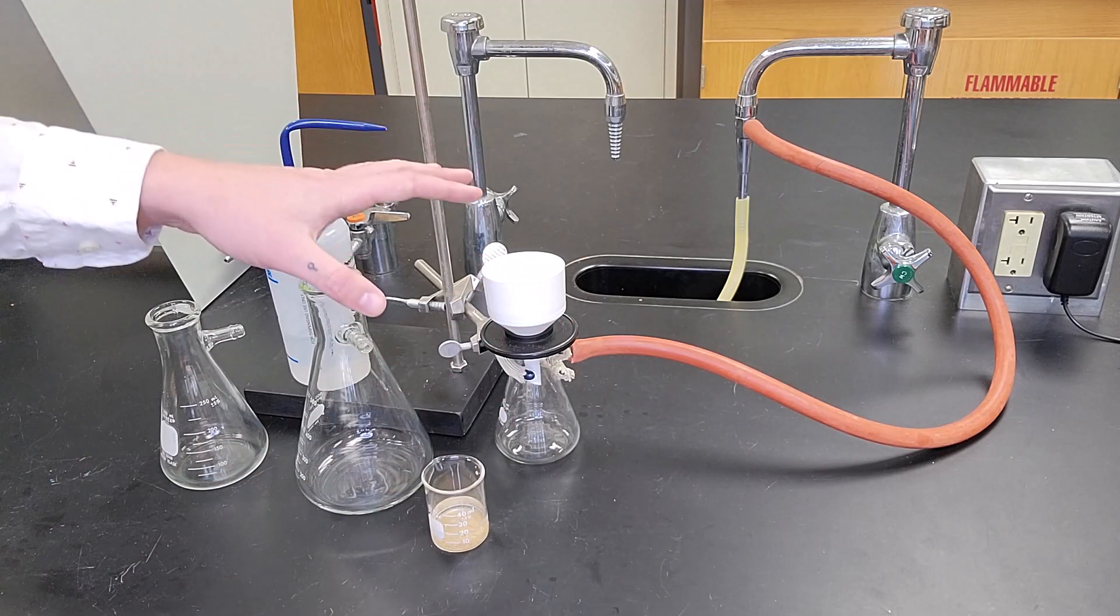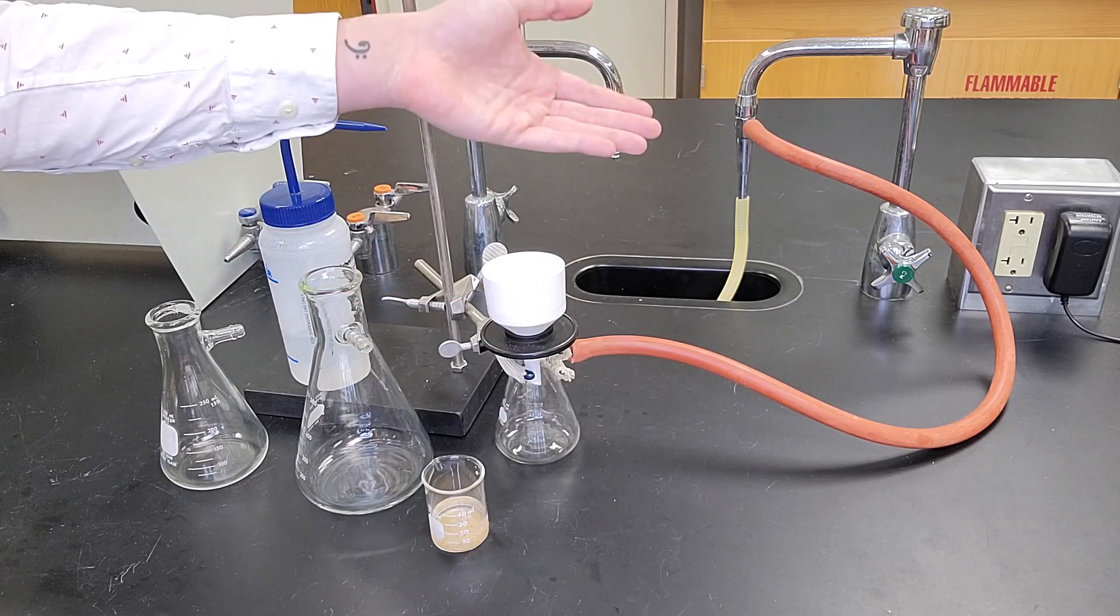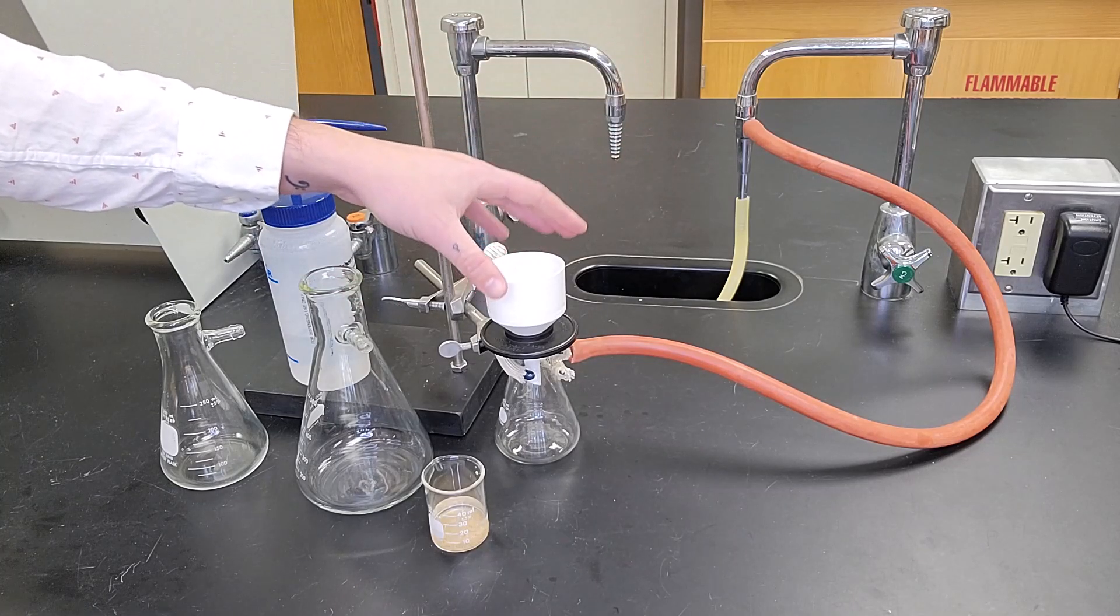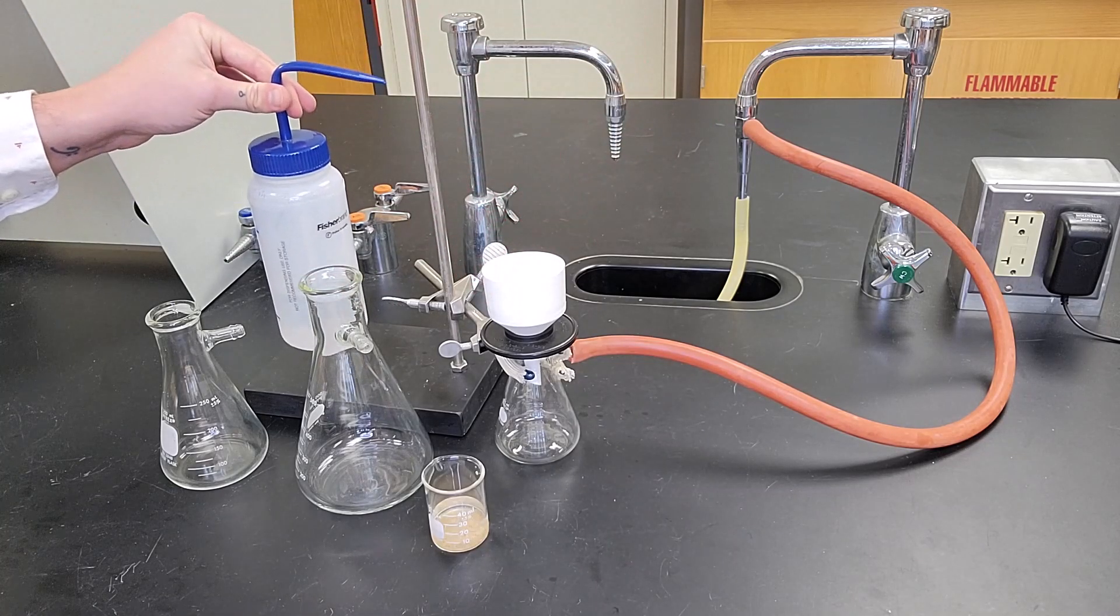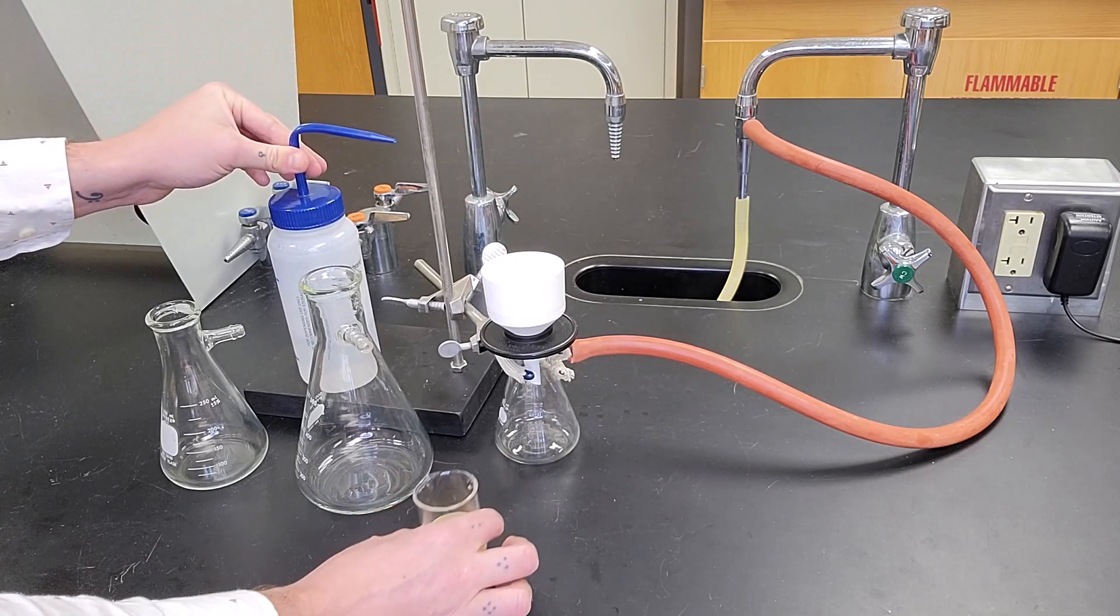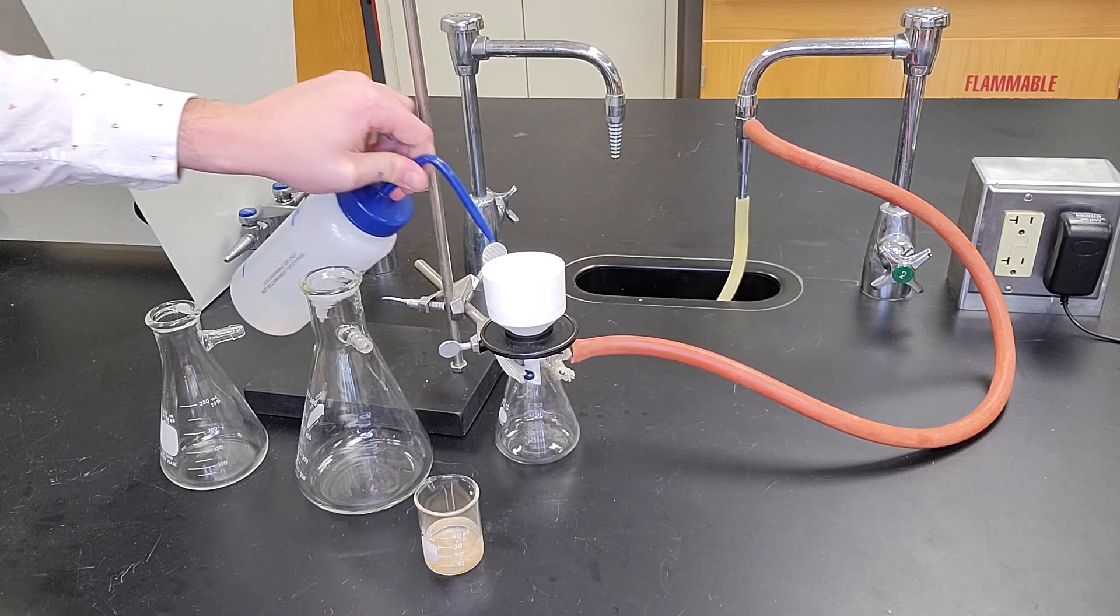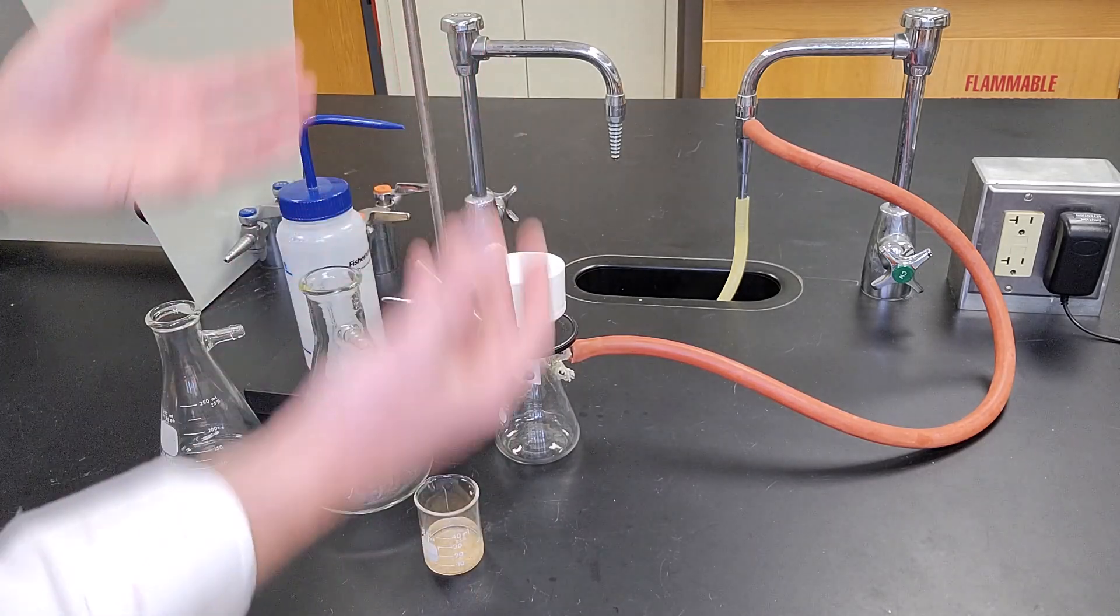The steps in which we do a vacuum filtration: we're going to turn on the water or turn on the vacuum pump, whichever one you're using. I'm then going to take a solvent bottle—in this case my solvent is water—and I'm just going to wash my filter paper with water and let it pull through.